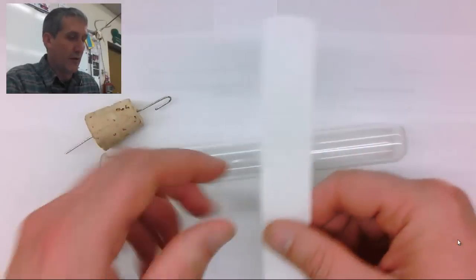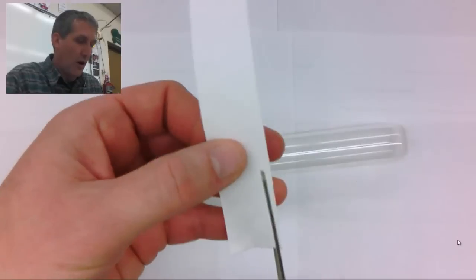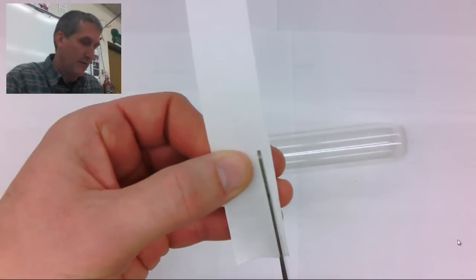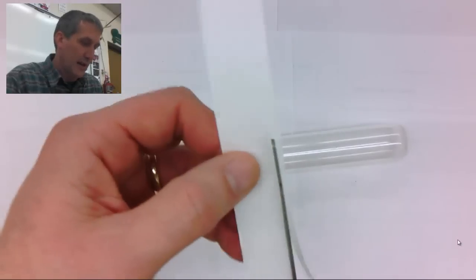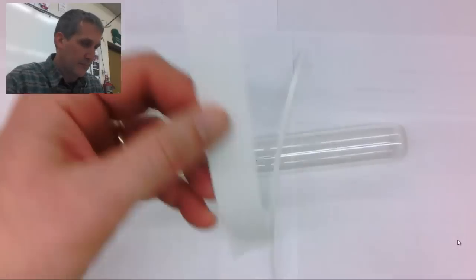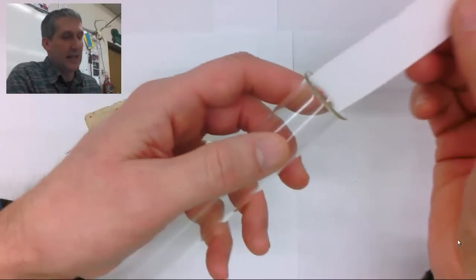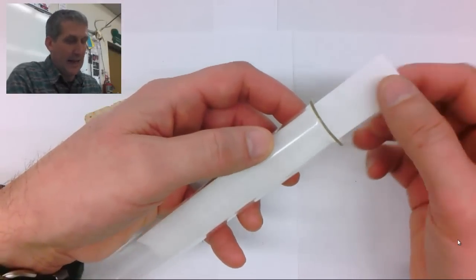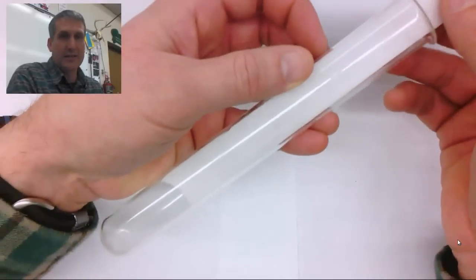So what we're going to do first is take about a quarter of an inch off the one edge of the piece of chromatography paper. Now check to make sure that it slides nicely and easily into the test tube.